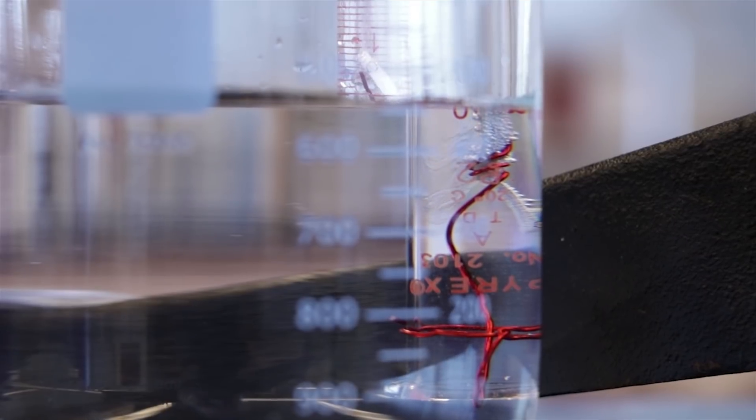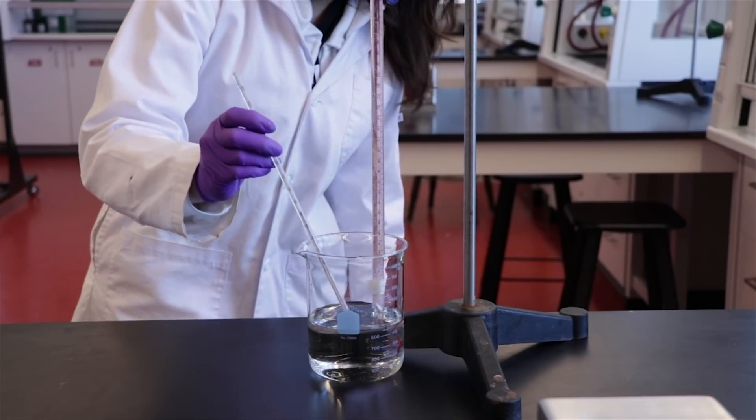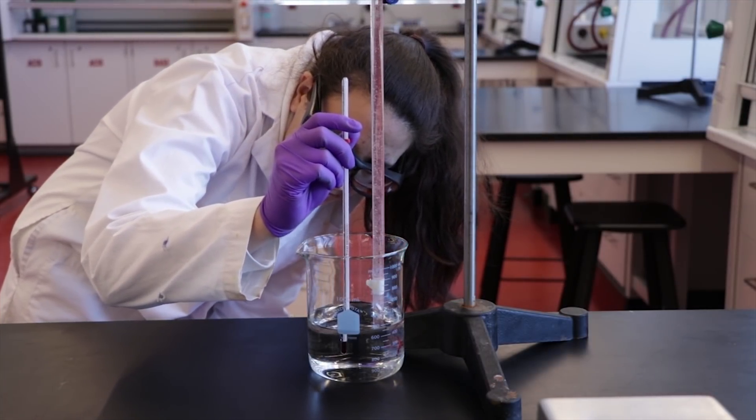The reaction is indicated by bubbling seen around the magnesium ribbon. During the reaction, measure the temperature of water every two minutes and take the average of these readings. Also remember to record the barometric pressure provided by your TA.